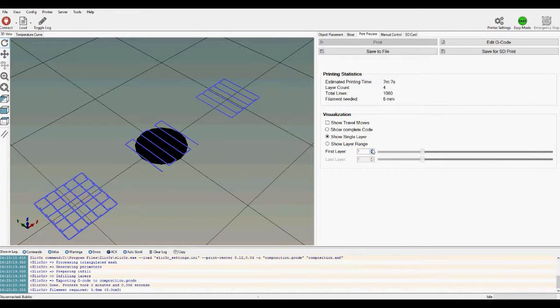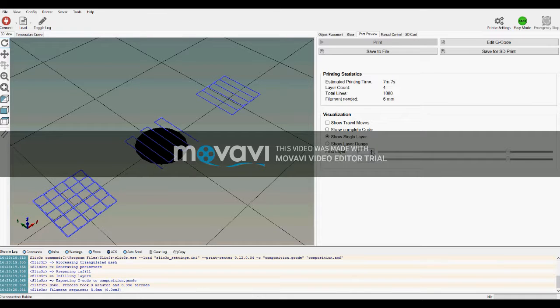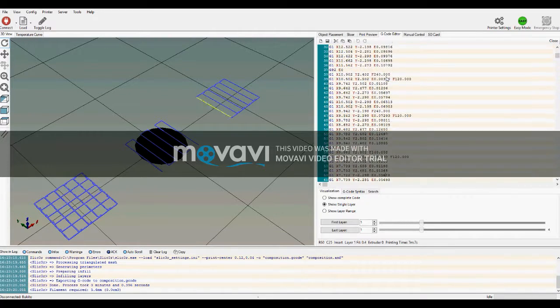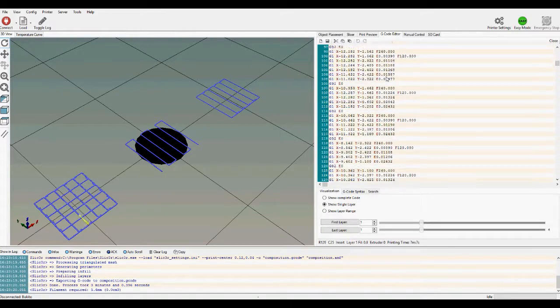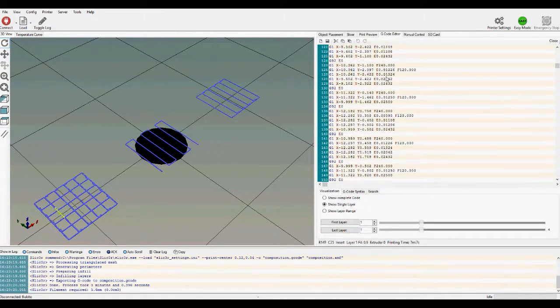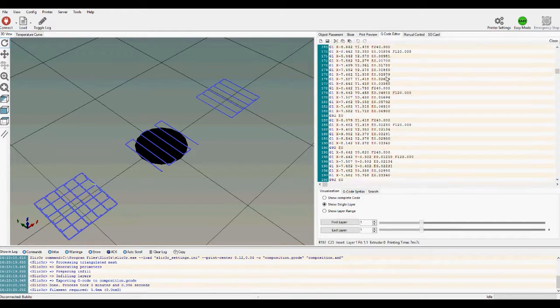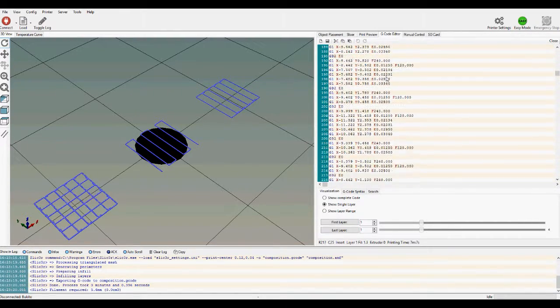Using the preview options in G-code, we can highlight the toolpath for each of these designs. While each design may look okay at first glance, the toolpaths demonstrate why the middle design will create the best output. This design forces Slicer to create the fastest, most consistent toolpath, which will yield the best results for bioprinting.